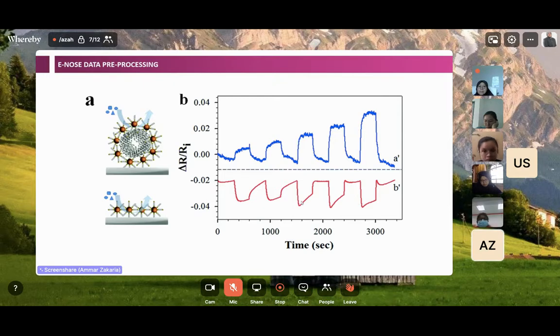So when you are measuring any particular analyte, you have to make sure that the environment you are dealing with is quite consistent. And then when you measure, you need to measure the gases in a short amount of time. You cannot measure for an hour, and then you compare again, and then try to replicate the sample.